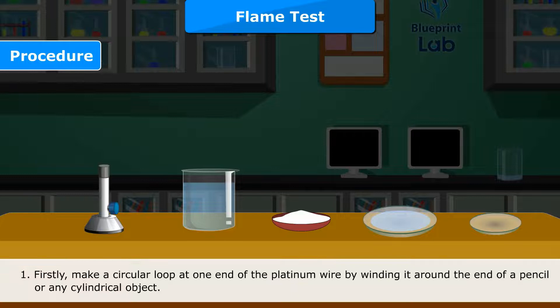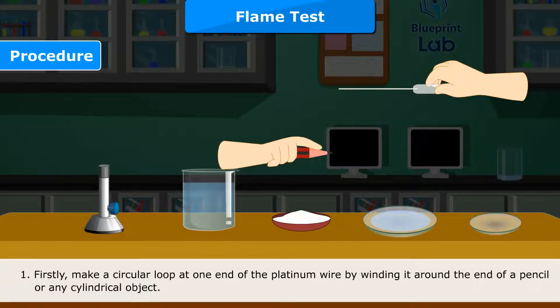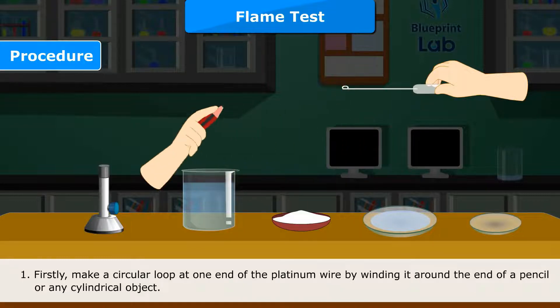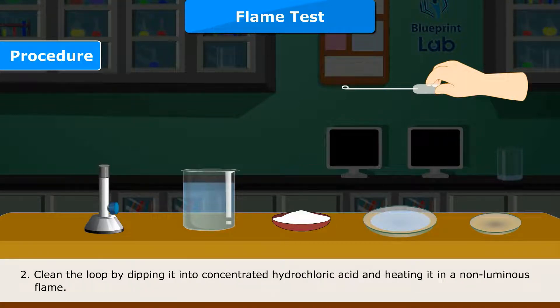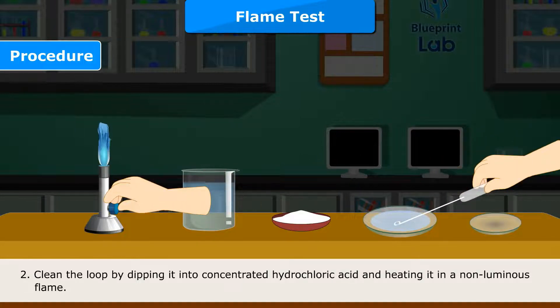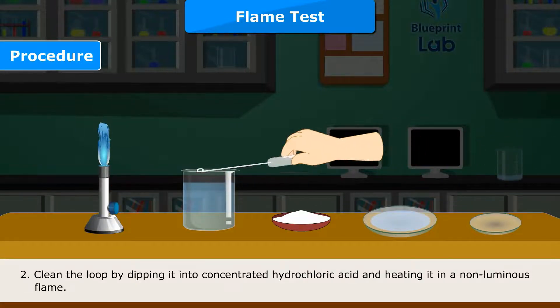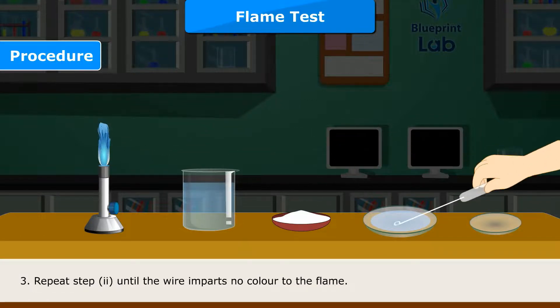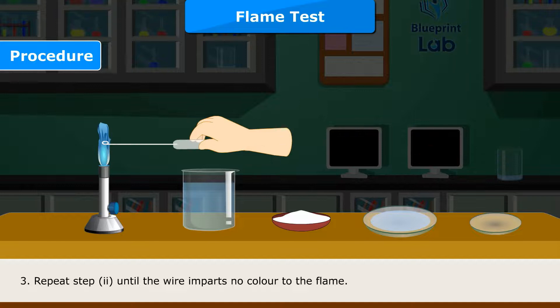Procedure step 1: Make a circular loop at one end of the platinum wire by winding it around the end of a pencil or any cylindrical object. Step 2: Clean the loop by dipping it into concentrated hydrochloric acid and heating it in a non-luminous flame. Step 3: Repeat step 2 until the wire imparts no color to the flame.